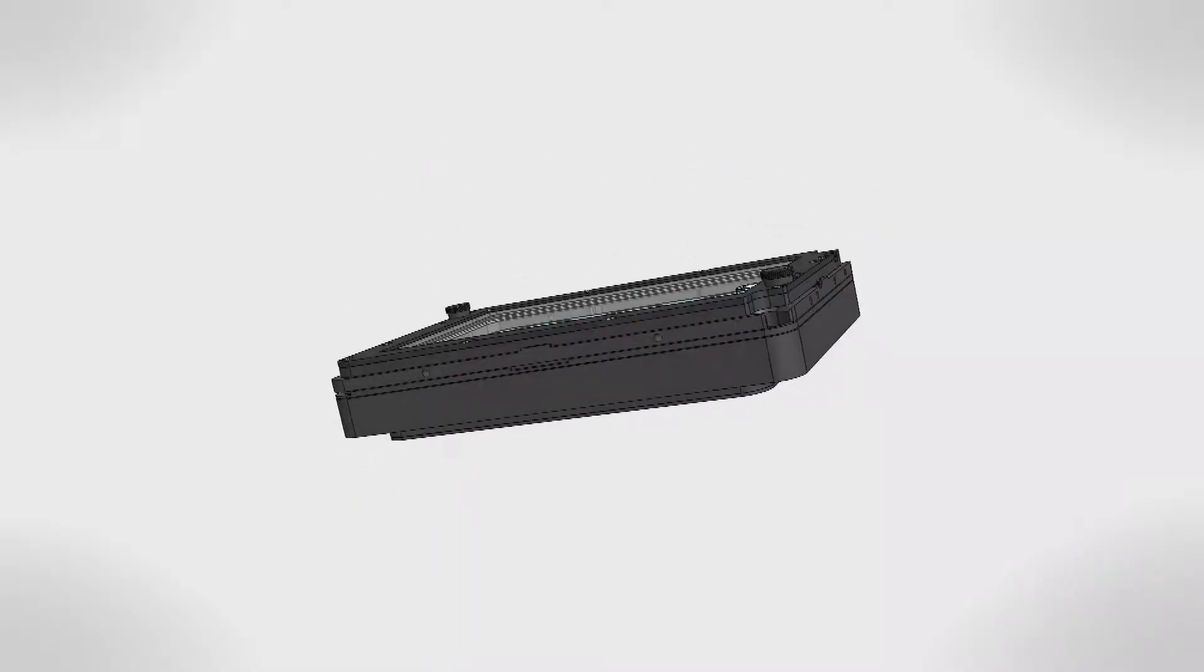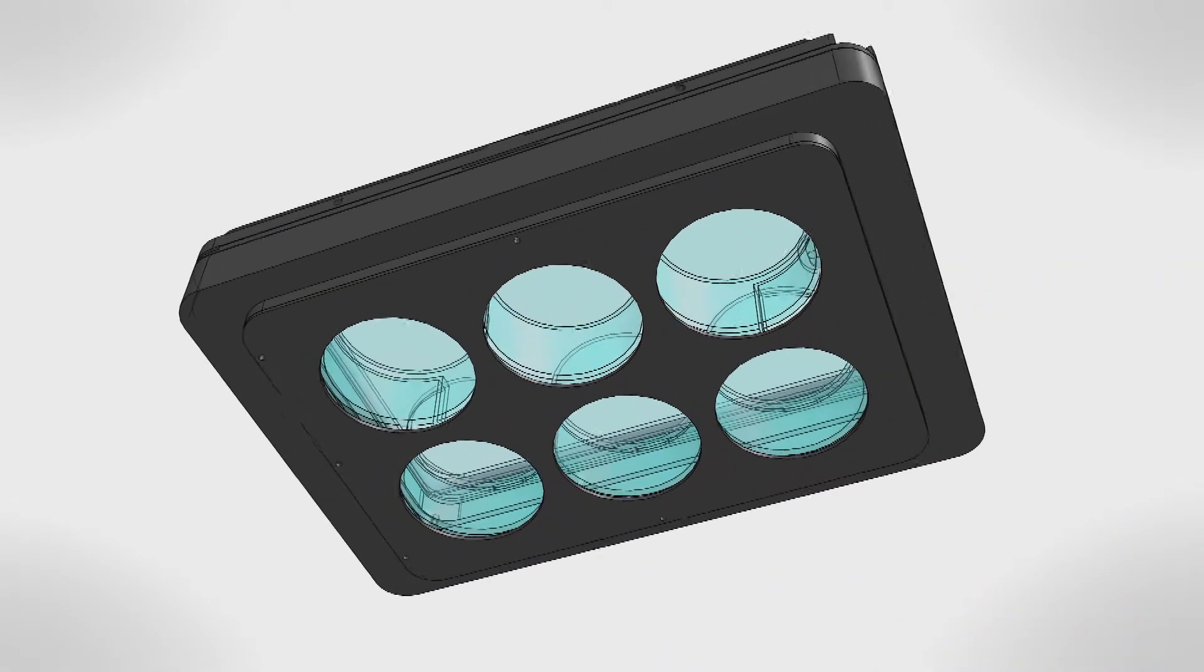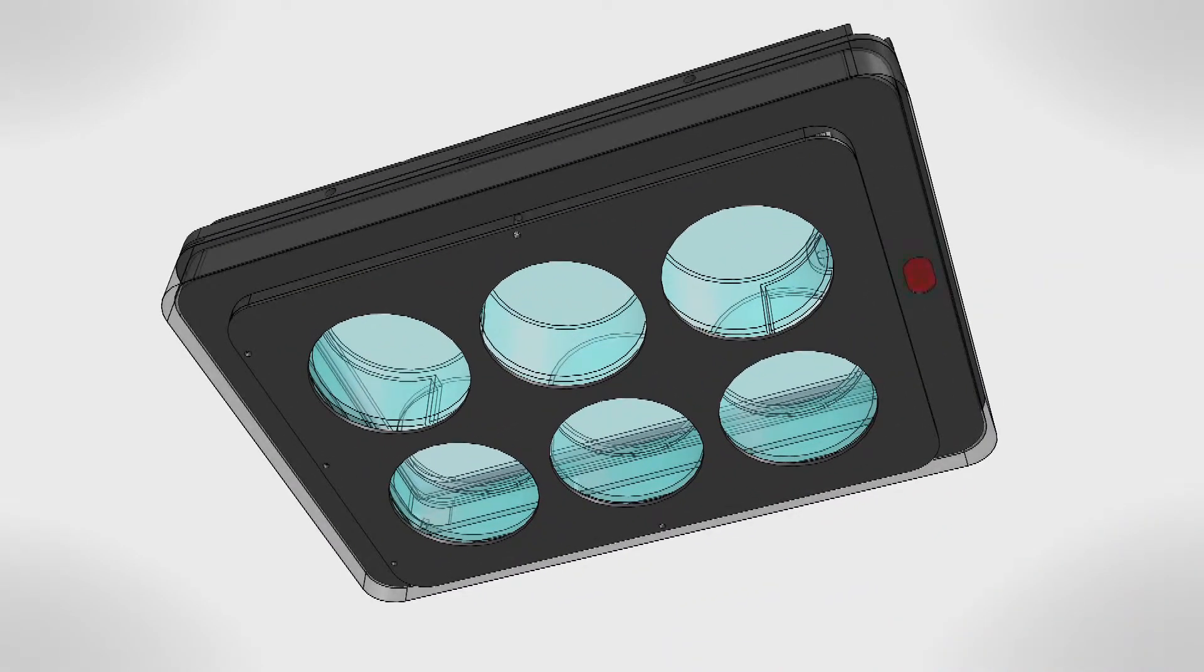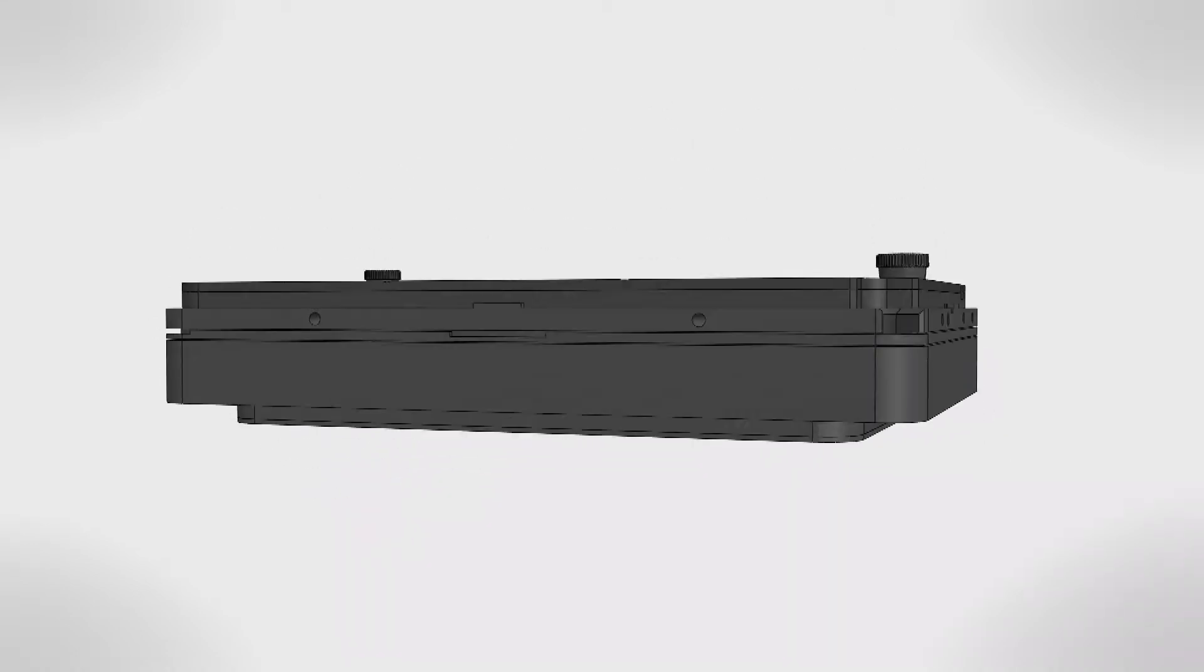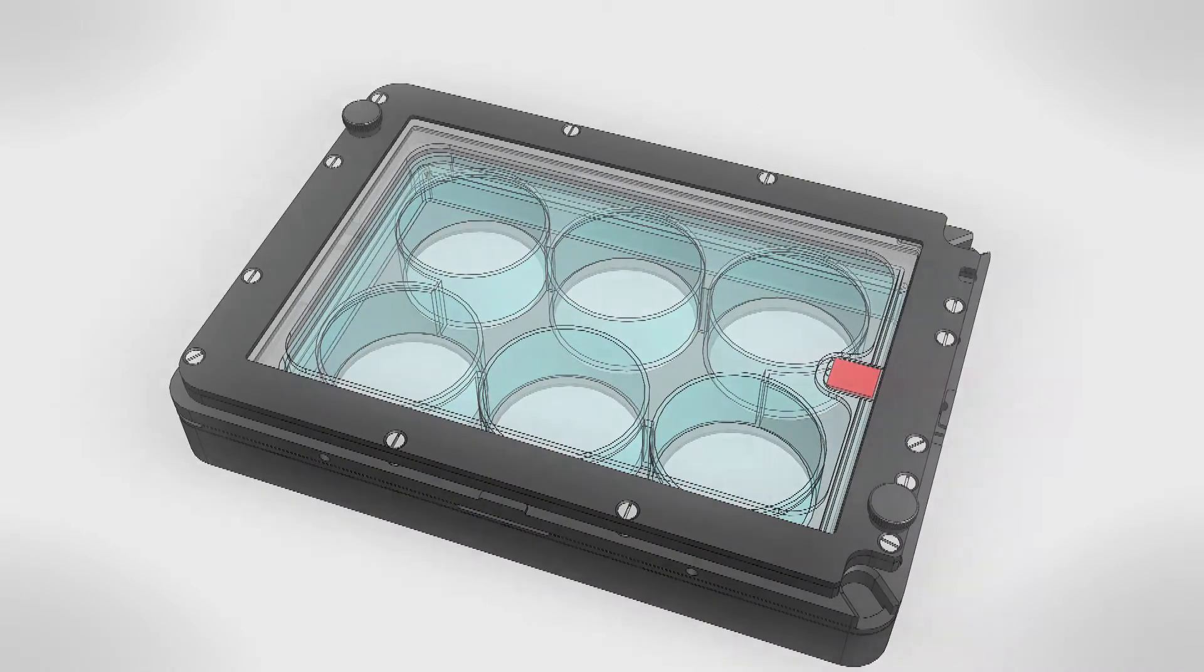The Boldline T unit controls the temperature of the chamber main body and of the heated glass lid, achieving excellent temperature uniformity and stability inside the chamber.